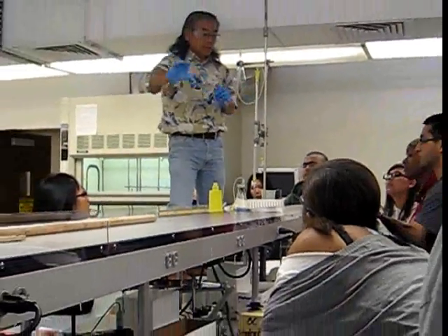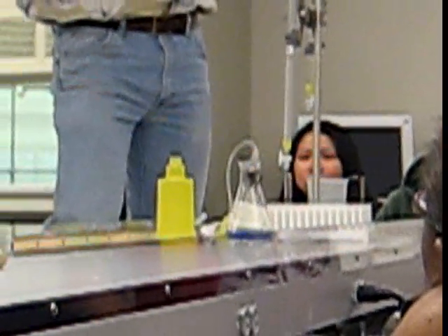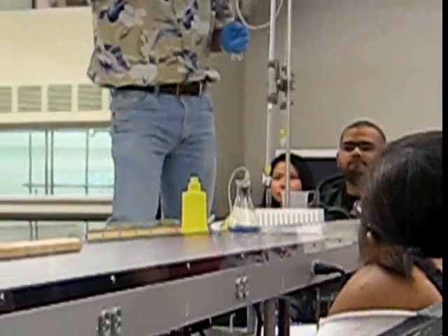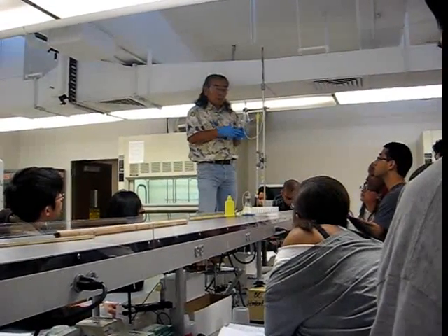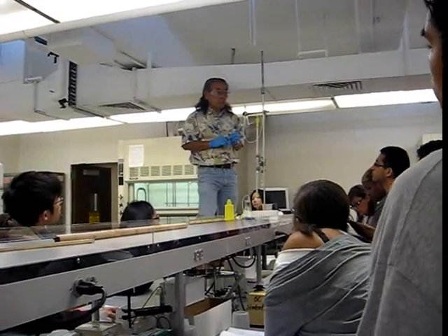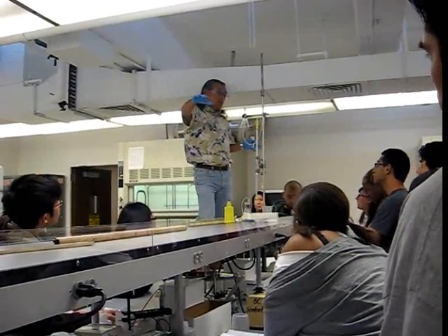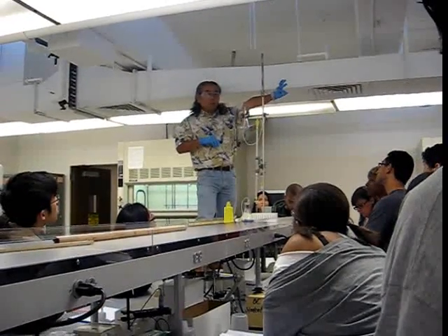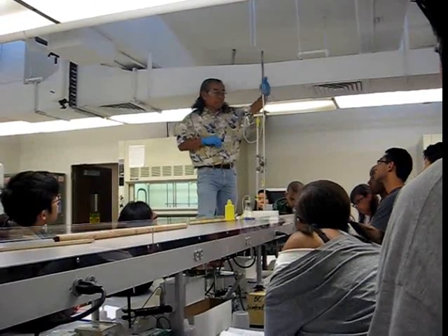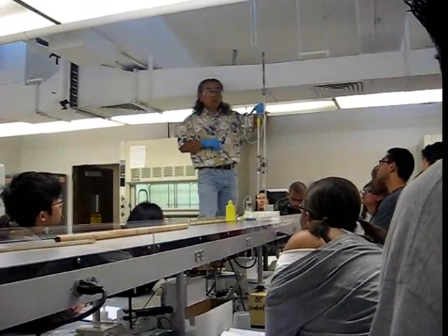One of you is going to have to be the fraction collector and one of you will have to go to the spec. That's an experiment — we have known and unknown. We need to generate a graph of the profile and a graph of the molecular weight. There are four wavelengths I think you would be using as well. There are only 11 specs in this room, one in the support room, and some older ones in the other lab. Those work just as well; it's just that you can't print your results out. You blank just like you would the ones here.